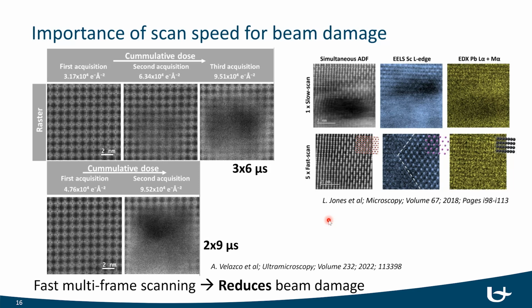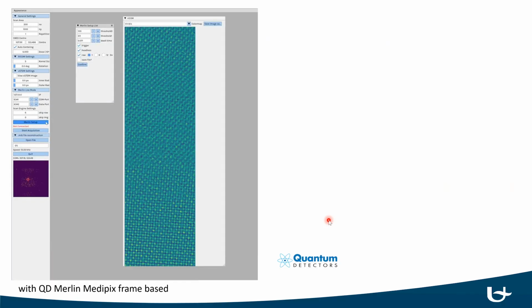If the frame-based cameras can get a little bit faster still, that will also be nice, and that will probably happen by working on, let's say, compression algorithms and things like that. So the only thing I still want to do is show you how we manage now to do the data treatment of this 4D STEM pipeline in real time, basically.